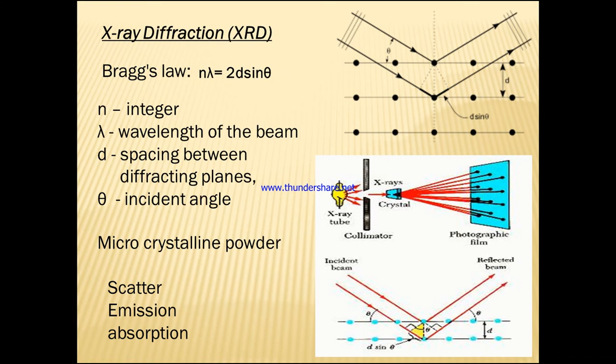So we are having zirconium material. When we take an example of the crystal, we are having the chloride, we are having the lithium materials. So these materials are used for the monochromator here. So in the same way we are having the detectors also. That is nothing but the photographic film, or the photographic methods, or the counter methods which we are going to use.